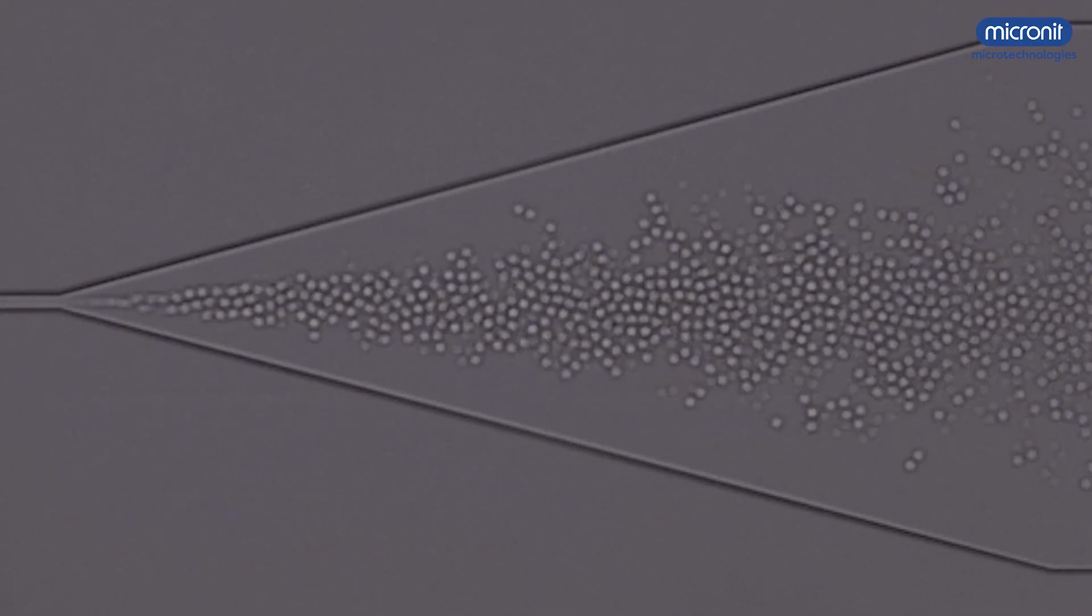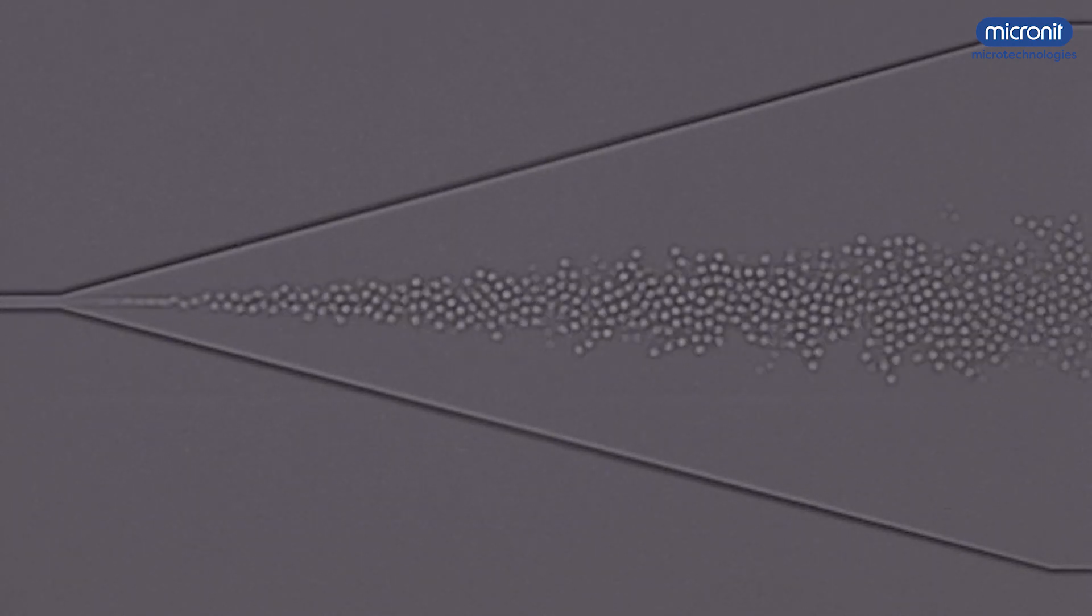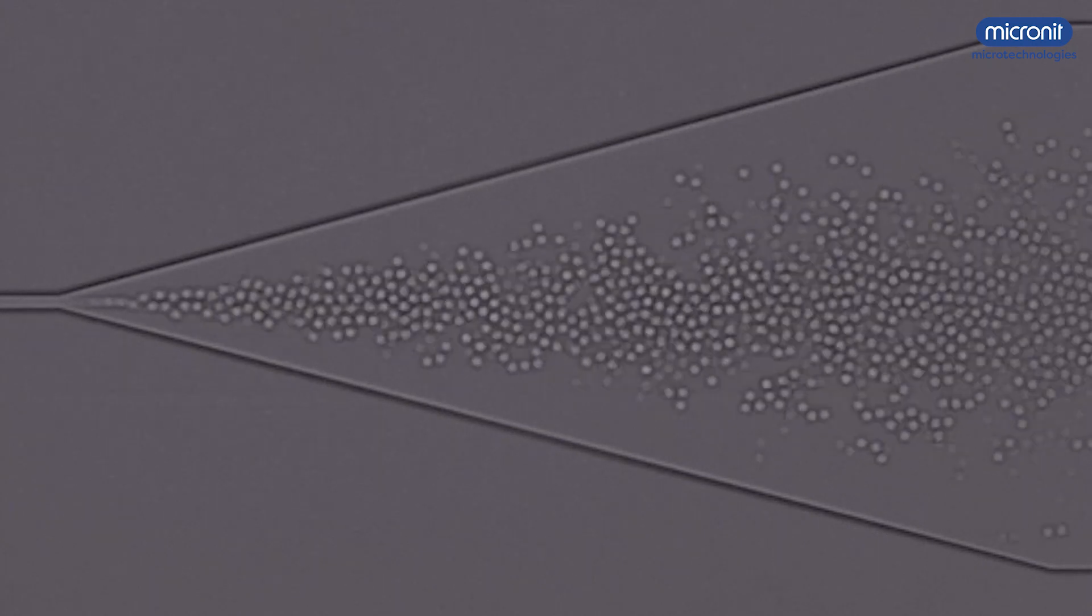By changing the flow rates or pressures of your two liquids, you can control how fast the droplets are produced and you can influence their size.